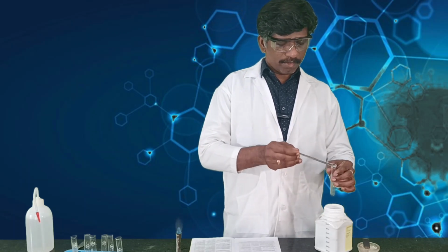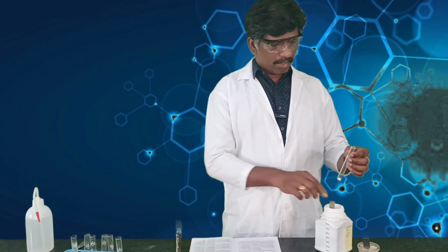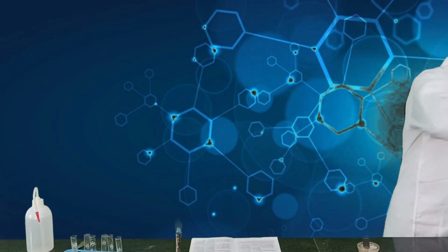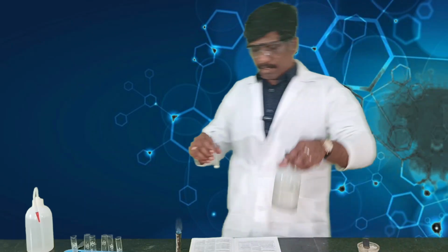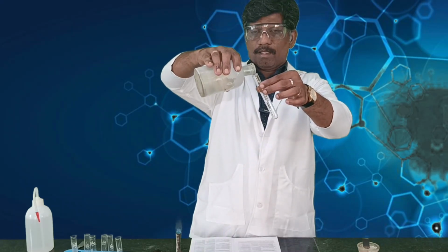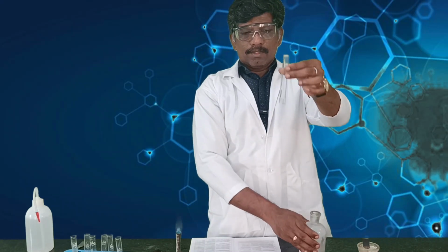I have taken the acid, and if you add sodium hydroxide, it will get dissolved. You can see it is completely dissolved.